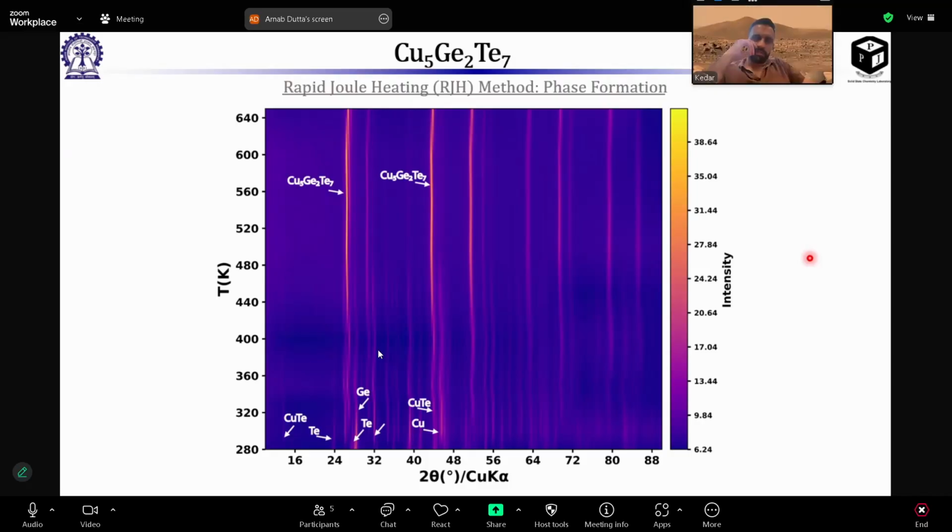So I think it's successful, right? There's no doubt about whether it's successful or not. Whether you want to do more, is the XRD from 99% phase purity good enough to report a new phase? Or do you need to do more things like beamline or single crystal XRD?